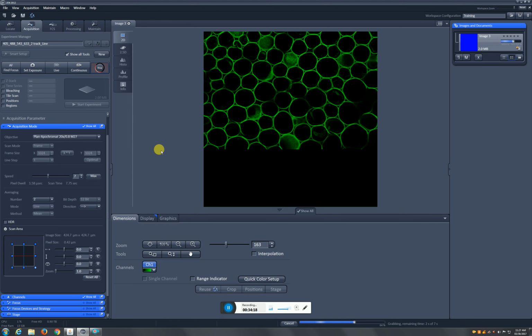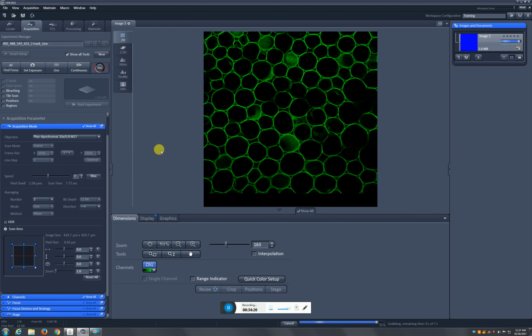But yeah, we're getting an averaged image now, and this can be useful for getting rid of a particularly noisy picture, right? So if you have a lot of noise, which is kind of transient signal going in and out, as you average it, that will go down, and your true signal will remain bright.